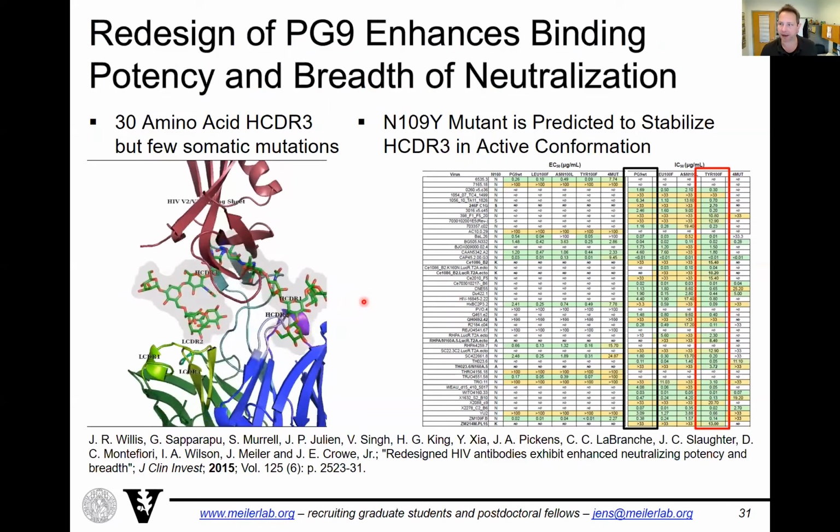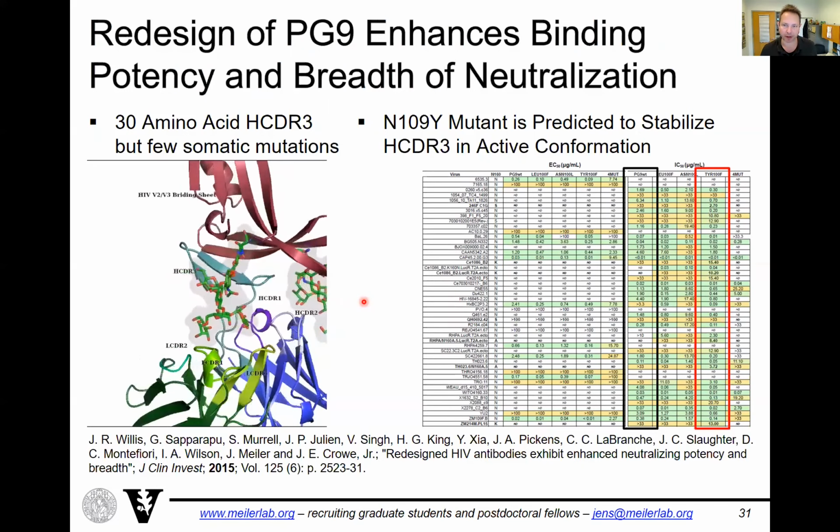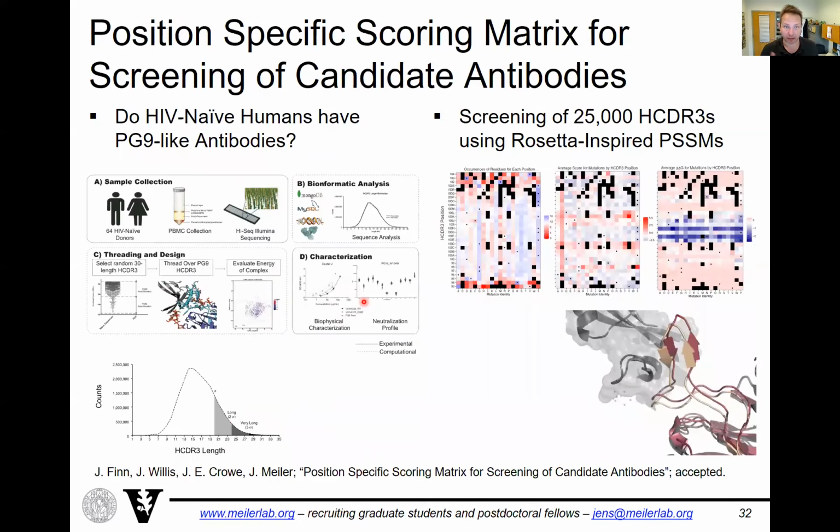Now, before we design immunogens, the question is, can humans, like you and me, make those antibodies readily? Within these 10 to the 11 low affinity germline antibodies, do we have some that look like that, with a few mutations we can turn them into an antibody that will really neutralize HIV?